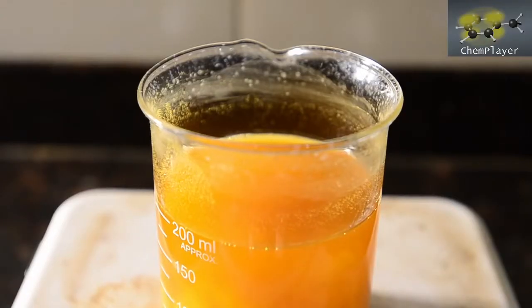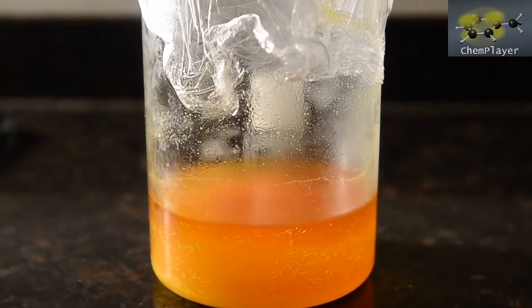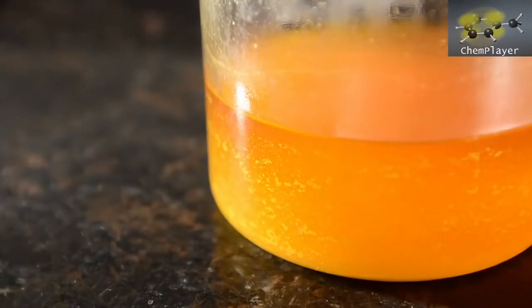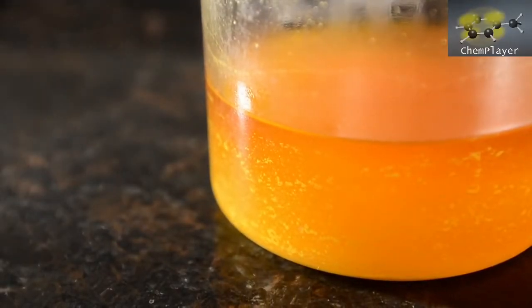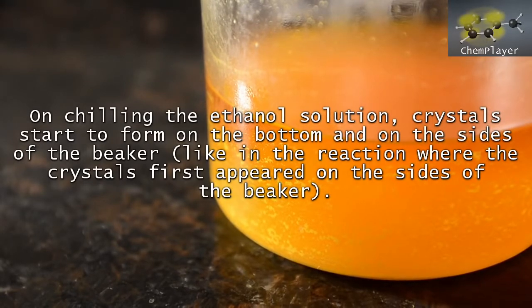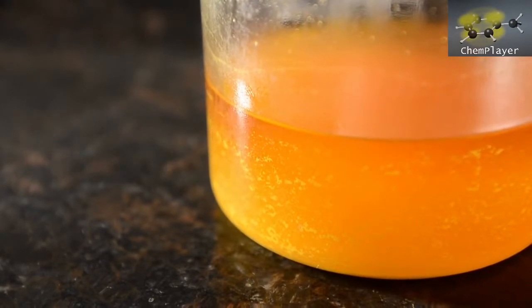So let's leave it to settle, decant off the ethanol solution, and then chill this down to see if we can get crystals. Sure enough, on chilling down we're getting crystals forming. We've noticed that this stuff likes to form on the glass. So let's filter.